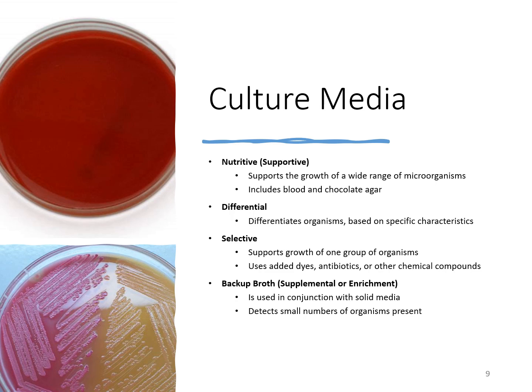You can also have broths, which can be supplemental or enrichment. This is typically used in conjunction with your solid media, and it can help to detect when there's just a small number of organisms in that culture swab or whatever specimen has been submitted.